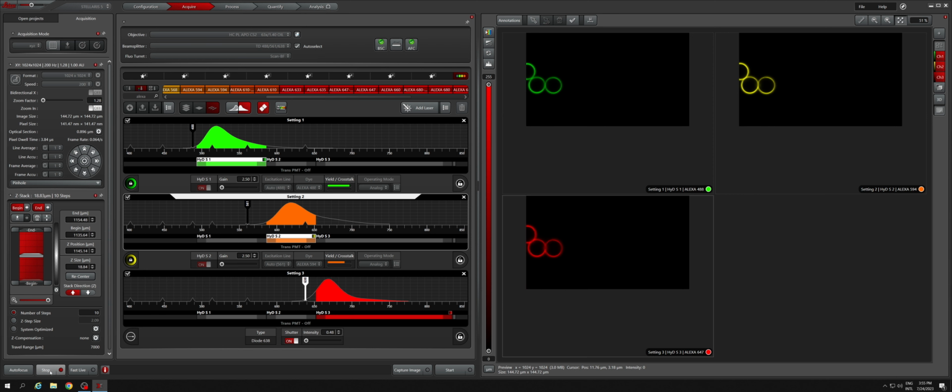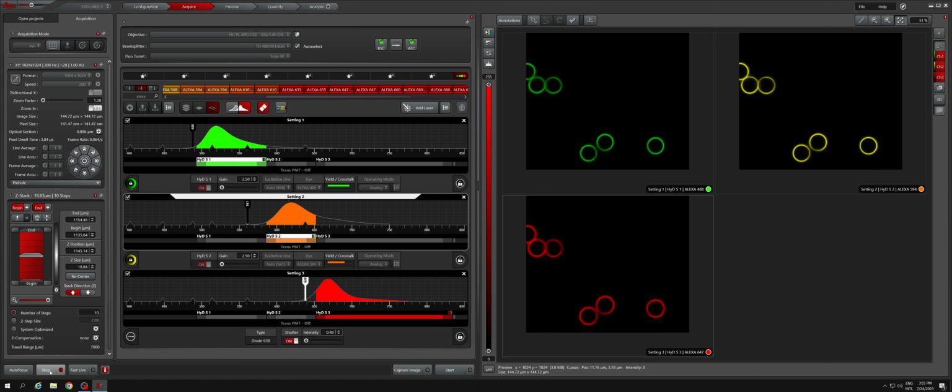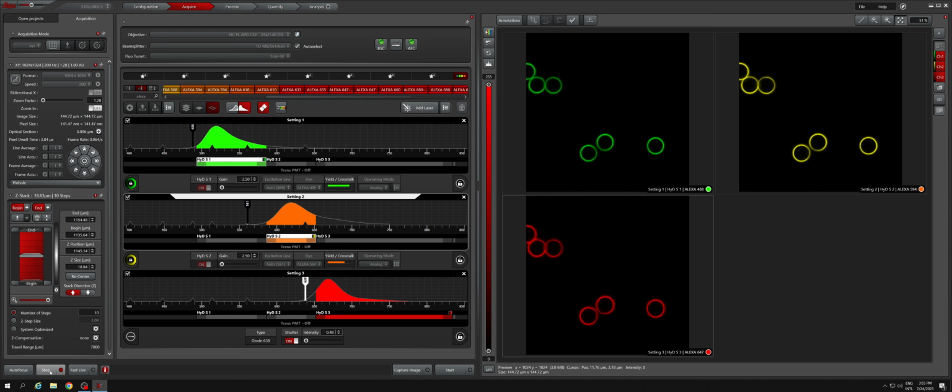But now, I'm just going to click live again just to get an example, just to see if everything looks okay. Sometimes it'll look a bit brighter when you've slowed everything down, but the minute everything looks pretty good, I'm just going to speed it up a tiny bit because it was so slow, but you can set it to whatever you want. It's totally up to you.